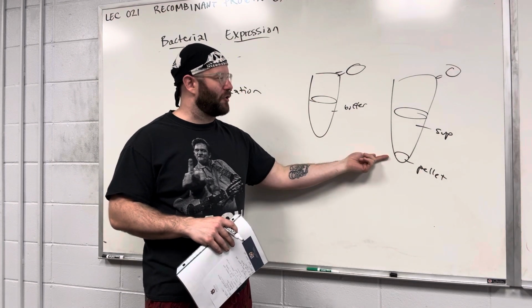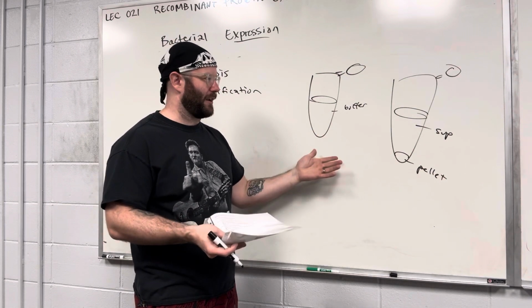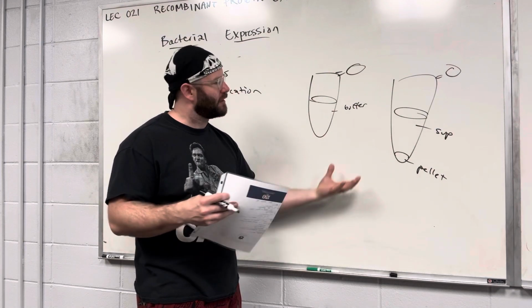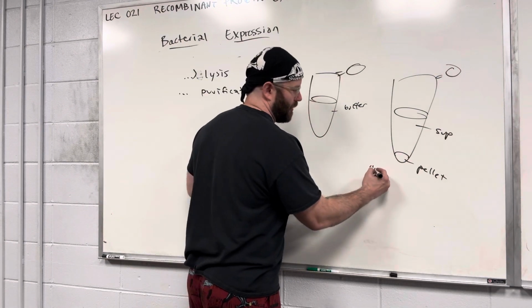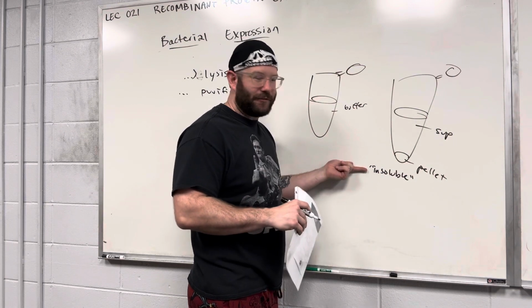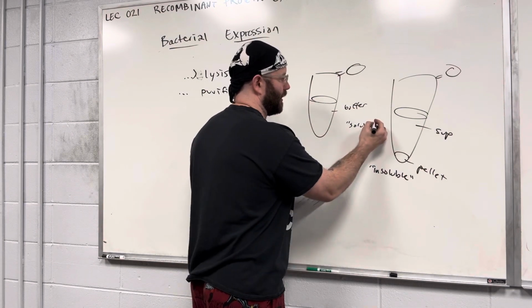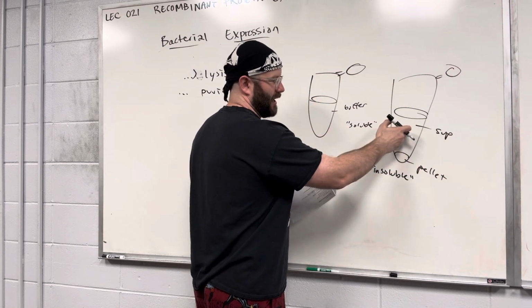Yeah, so this is a complex question, and it's context dependent, depending on the protein. You're correct that what's usually in the pellet is large cellular chunks, like cell wall stuff and other things that are, quote unquote, insoluble. So insoluble stuff goes into the pellet, and soluble stuff, which means it can dissolve in the buffer, which is usually a baseline of water, will stay in the soup.